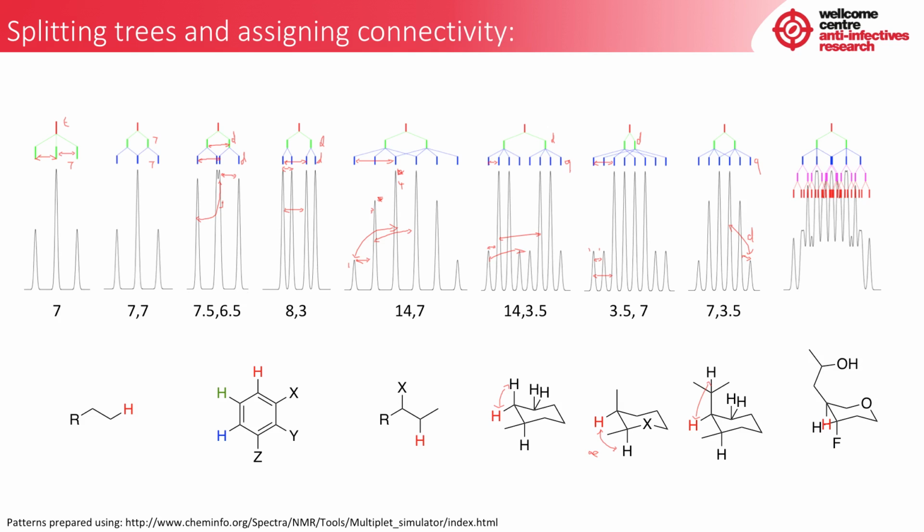There are other factors. Measured J values rarely match exactly because the lines are very thick and they can become distorted. They can have other protons underneath, and they can display other phenomena that we'll cover in later talks, such as roofing and second order effects.